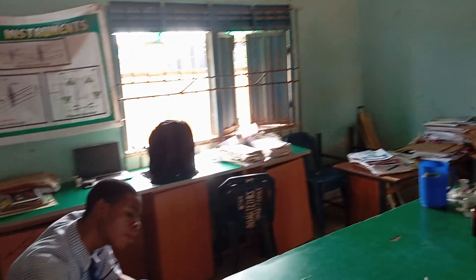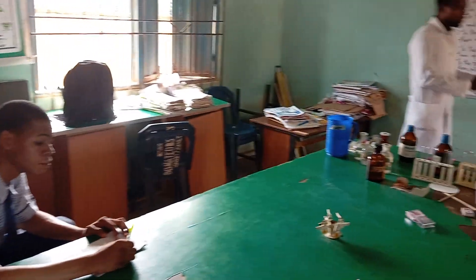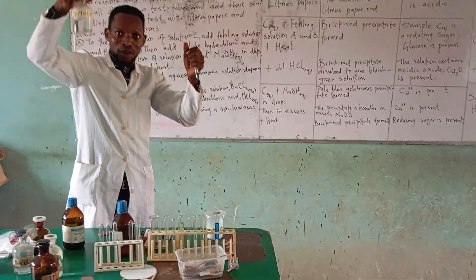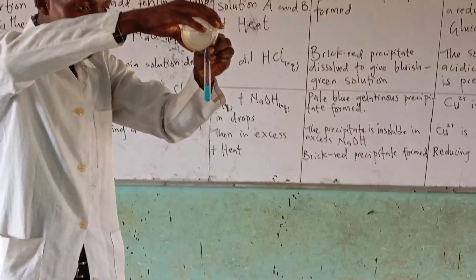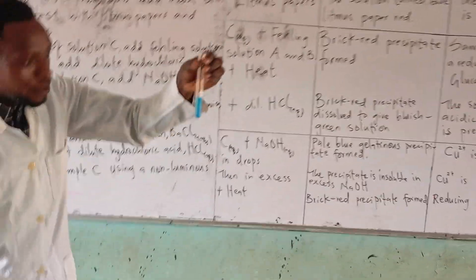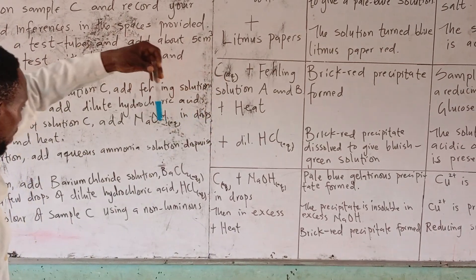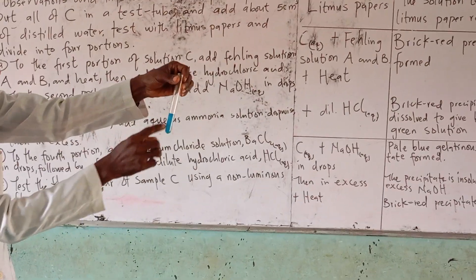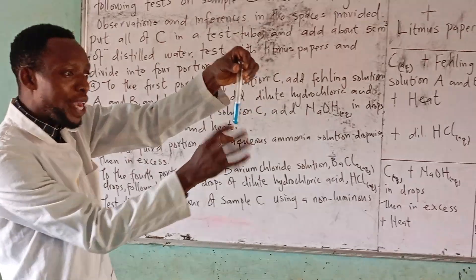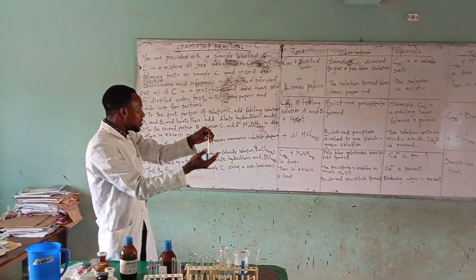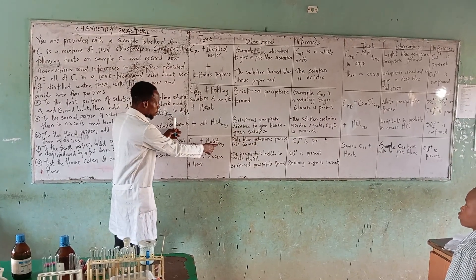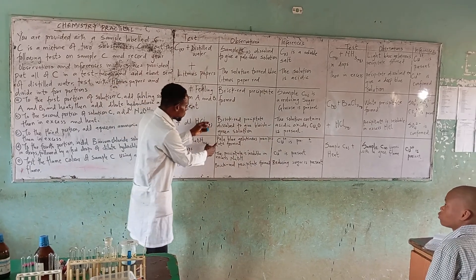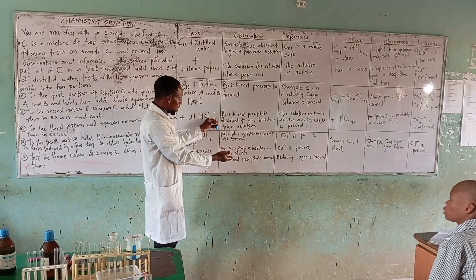Let's go to the second portion. To the second portion of the solution, add sodium hydroxide in drops, then in excess. We have our sodium hydroxide here. Adding it in drops — can you see what we have? This is a gelatinous precipitate, and the color is pale blue or light blue. So you record: C (aqueous) plus sodium hydroxide in drops → pale blue gelatinous precipitate formed.